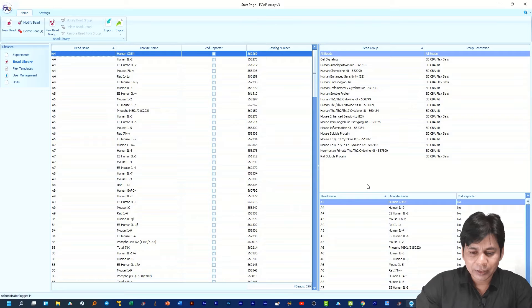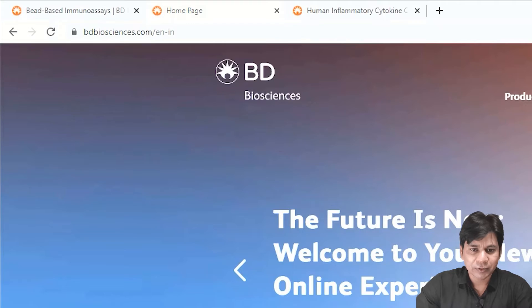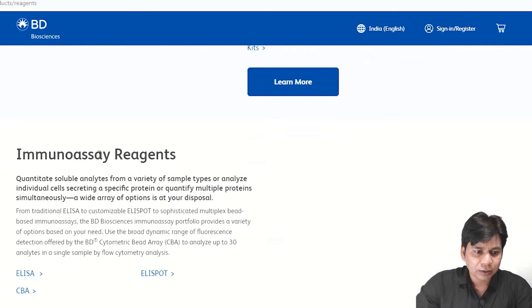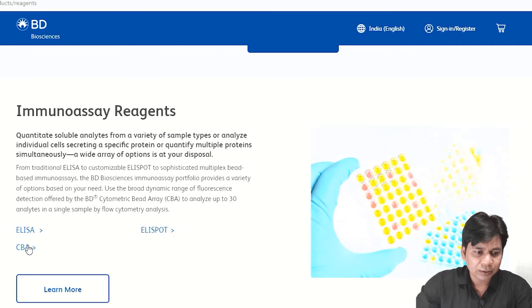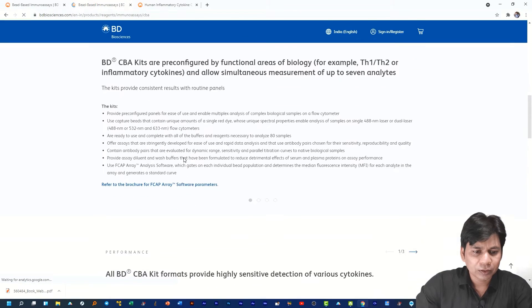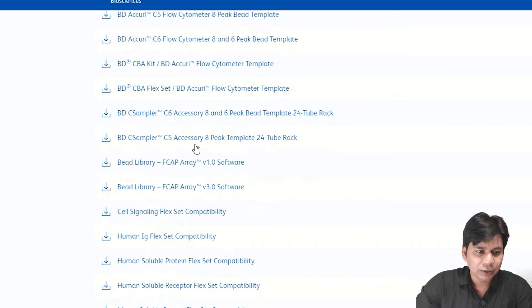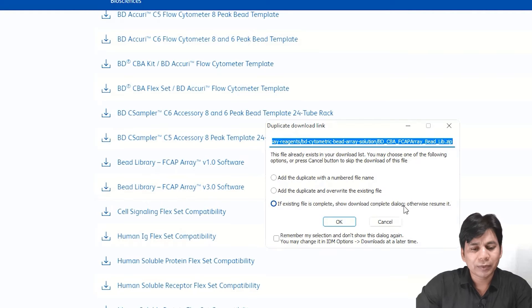I am going to show you how you can download the bead library file. For this, you have to open the BD Biosciences website, click on 'Products,' then click on 'Reagents,' then click on 'Immunoassay Reagents - CBA.' Then scroll down and you will see 'Tools.' If you click on Tools, you can see a list of many software items, templates, and bead libraries. You can see here the bead library for FCAP Array version 3.0 software — you can download it. I have already downloaded it, so I am clicking Cancel.